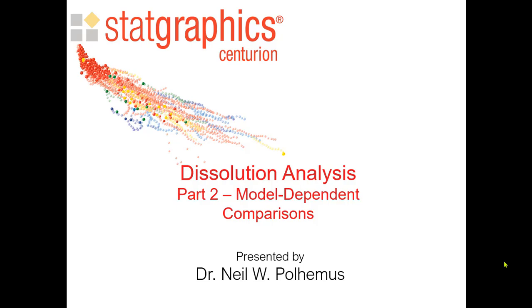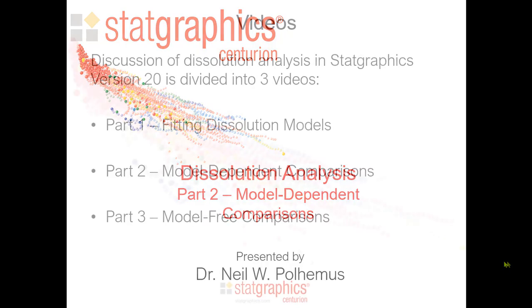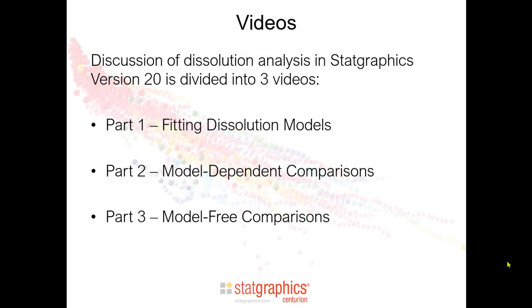Welcome to part 2 of our discussion of dissolution analysis added to Statgraphics version 20. I have divided the discussion of dissolution analysis into 3 videos. Part 1 had to do with fitting dissolution models to data from standard dissolution studies.